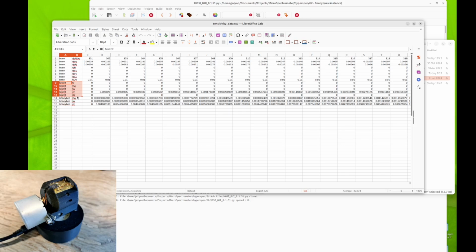So I've added blue tit spectral sensitivities, long, medium, shortwave, UV, and double cone functions, and also honeybee, medium wave, shortwave, and ultraviolet. The data here are just normalized so that the area under the curve is 1 for each channel to give them equal weighting. So that's the sensitivity data.